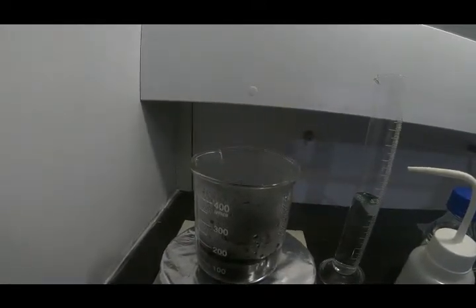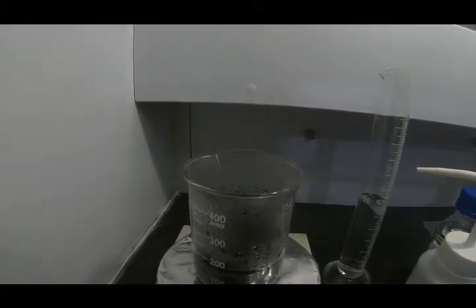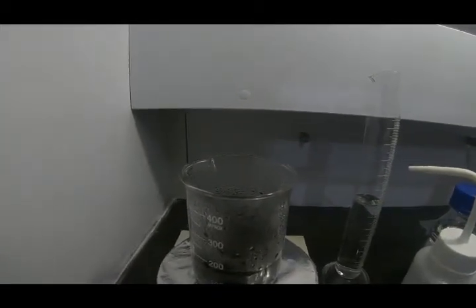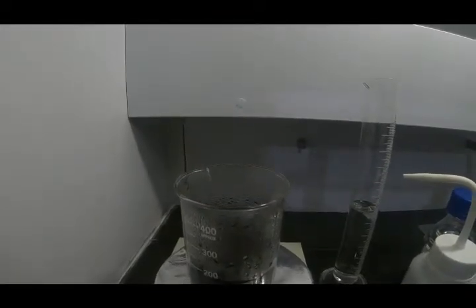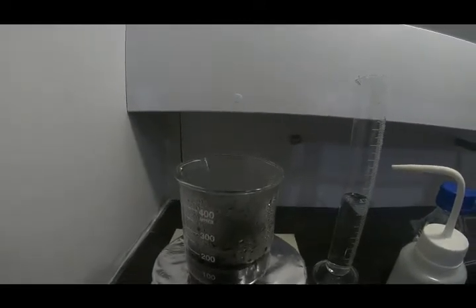It just absorbs all of the palladium chloride, so you can wait for 2 hours, but to go ahead faster, you can just remove the beaker from the stirring and wait a little bit for the carbon to settle down. If the upper layer does not have any color, you can proceed to the next step, which is adding the formaldehyde as the reducing agent. So we just wait for 2 hours and then we move to the next step.